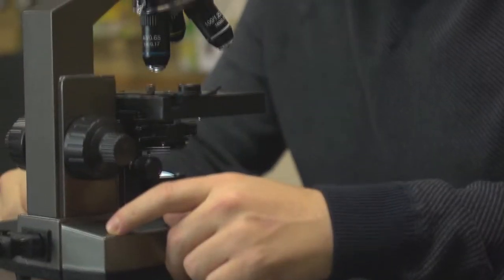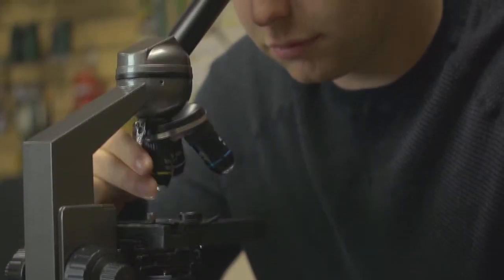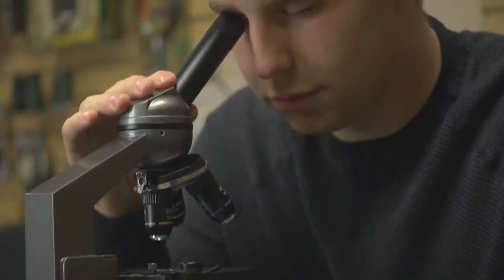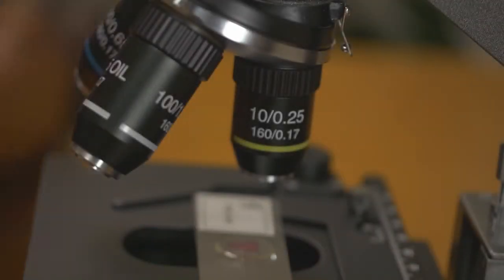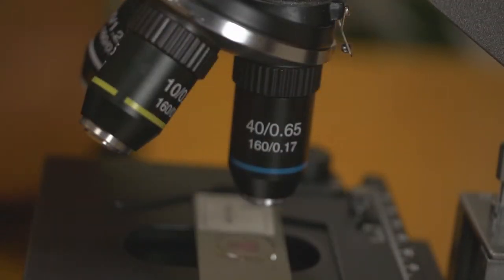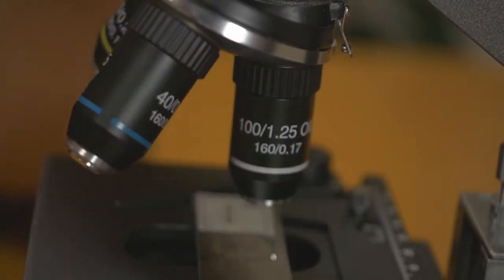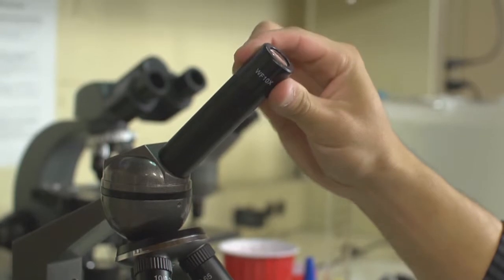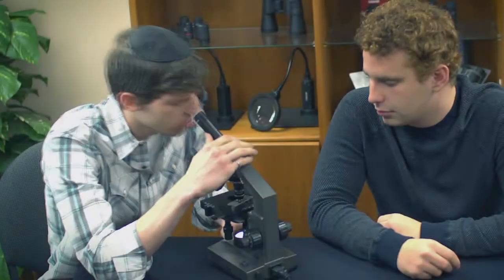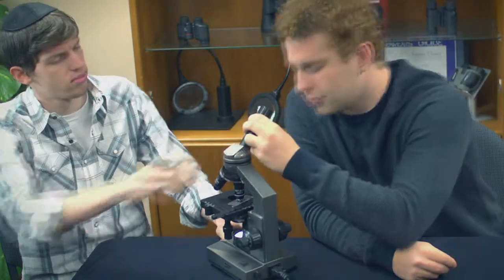This 100 to 1000 power microscope includes three objective lenses and a 10 power wide field eyepiece. You can easily choose between 100, 400, or 1000 power total magnification. The eyepiece sits on top of a 360 degree rotating monocular head that's great for adjusting your position or sharing results with others.